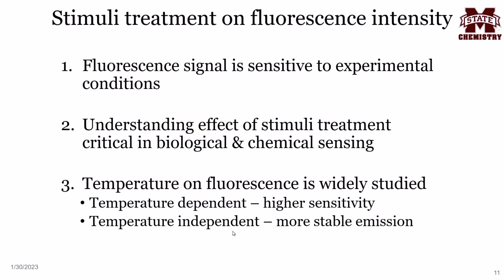The mathematical model can also be used to study the effect of stimuli treatment on fluorescence intensity. Fluorescence signal is highly sensitive to experimental conditions, and understanding the effect of stimuli treatment is critical in biological and chemical sensing, as well as for material development.